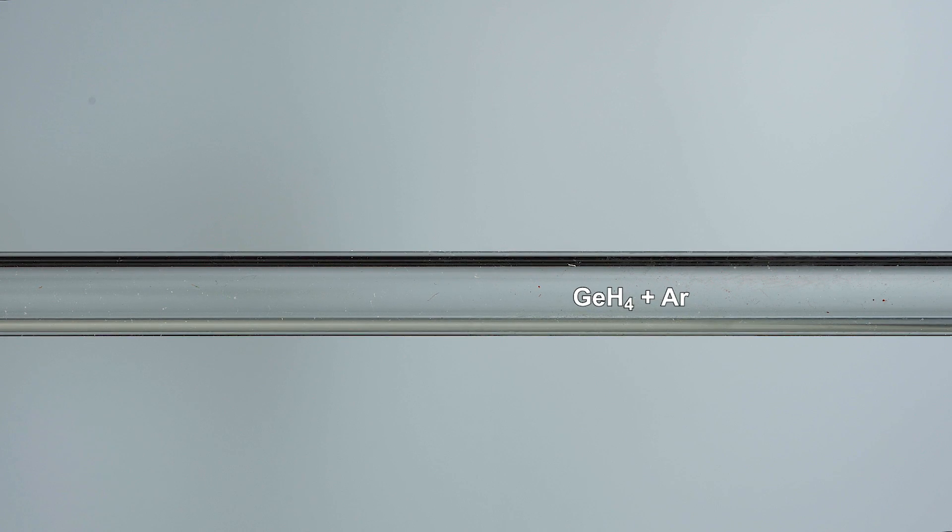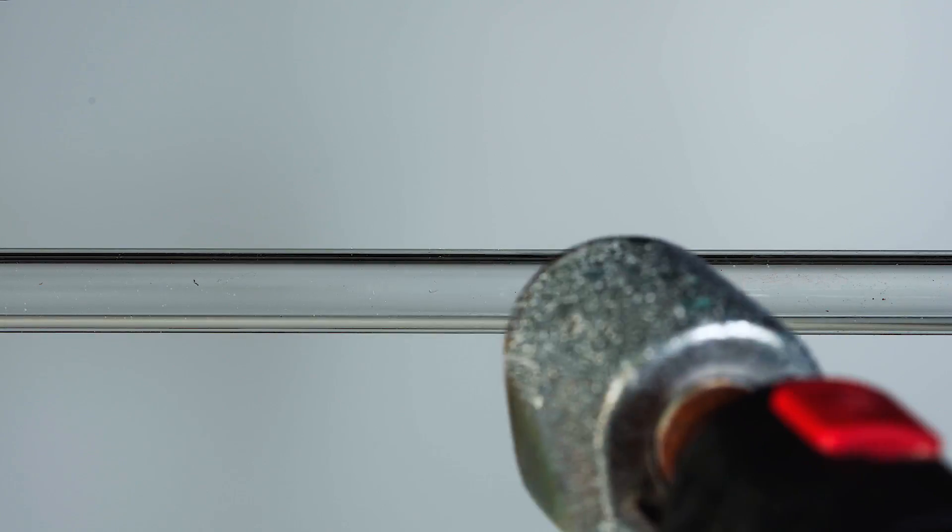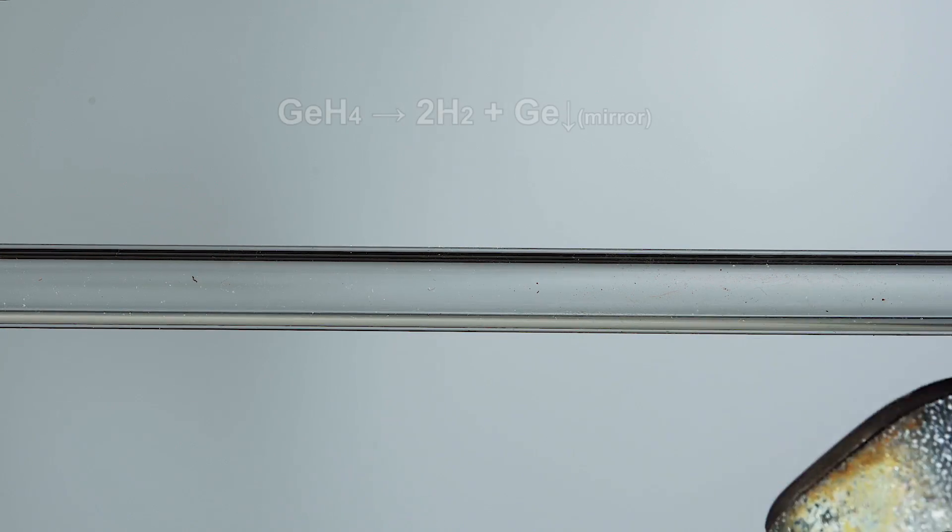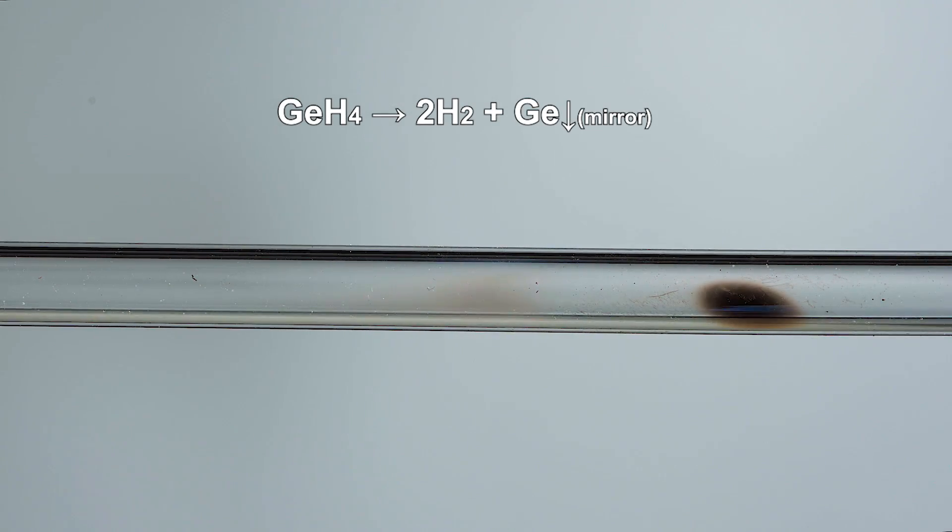And now it's time for the most interesting reaction, that is the germane decomposition reaction in a glass tube with the formation of germanium mirror. When the temperature in the tube starts to exceed 300 degrees Celsius, we'll be able to see germanium mirror forming.